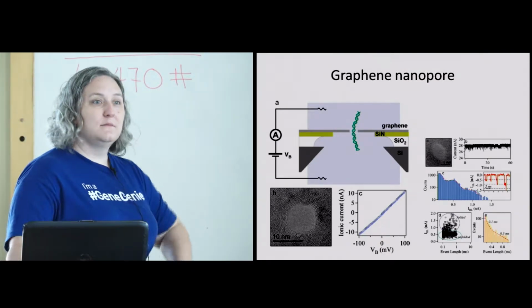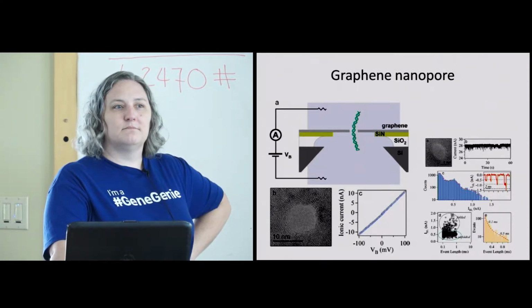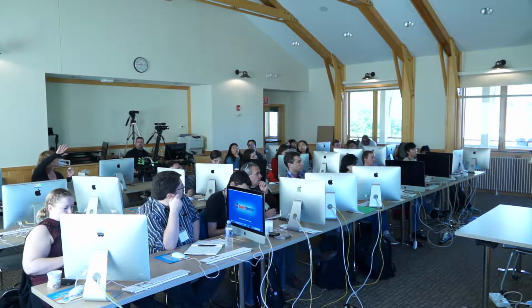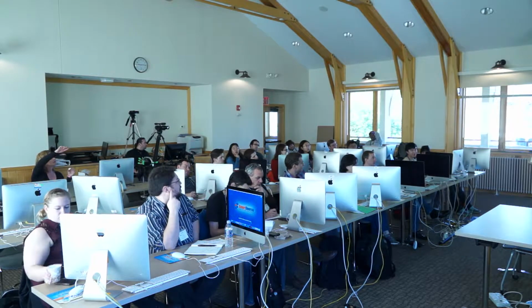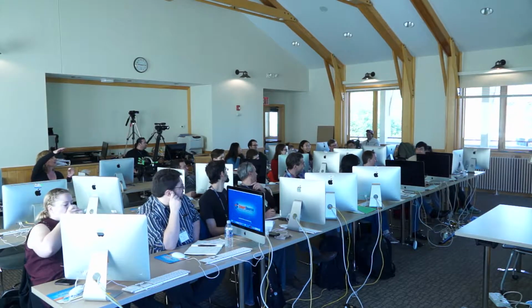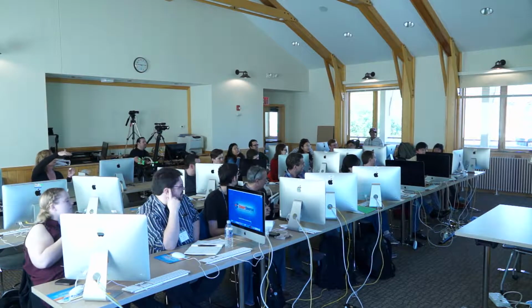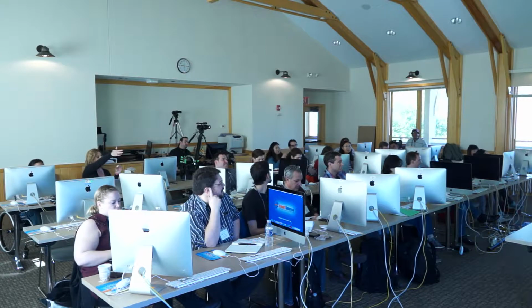And maybe just to finish this, does everybody know what graphene is? It's single atom carbon. And the reason for pursuing this, tell me if I'm wrong, is that from a manufacturing standpoint, making a chip with alpha hemolysin pores is kind of, as the Brits say, bespoke. Does that sound right, Jonathan? I'm never sure if I'm saying that word right, but it's a custom, tailored thing, whereas this potentially could scale.